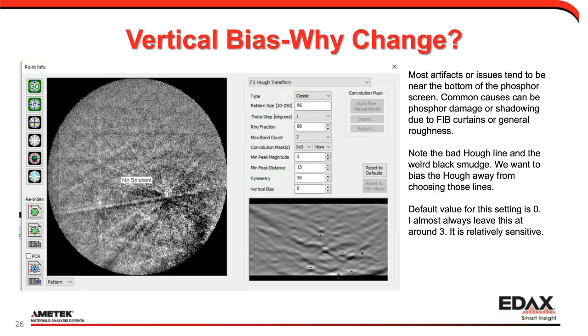Somebody asked how to index multi-phase steel microstructures, with martensite and ferrite. I believe there's actually an application note on that, and I'll go ahead and try to send that note to you. It depends exactly what level you're looking at, but it can be done using things like IQ as a differentiator.